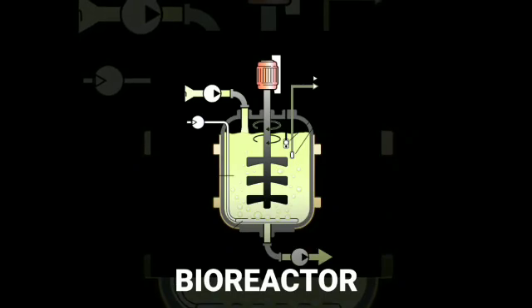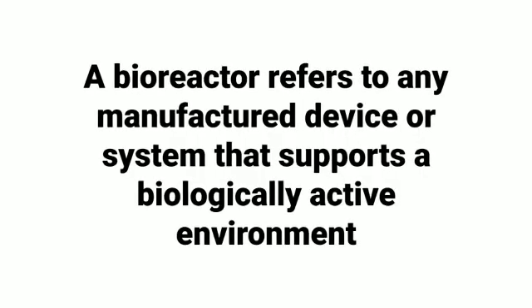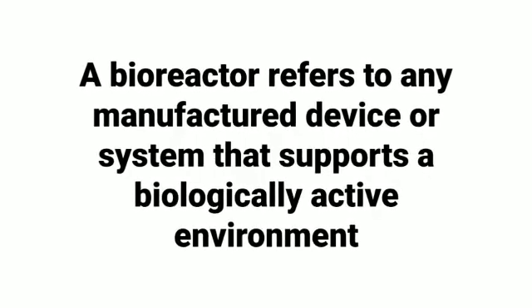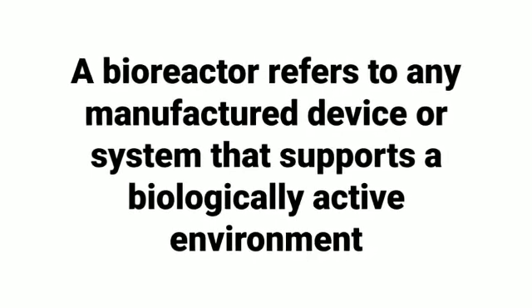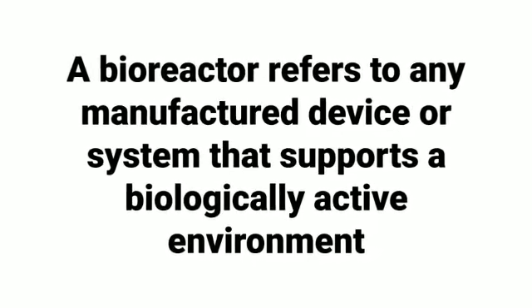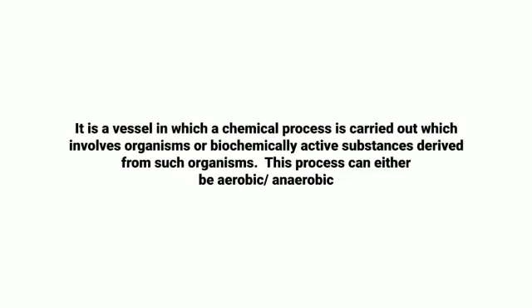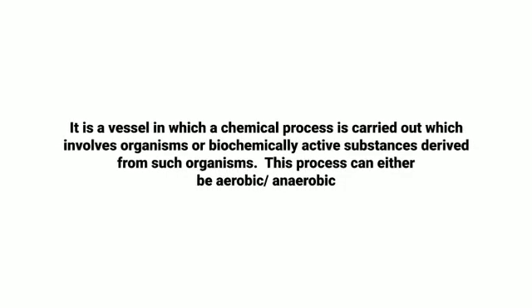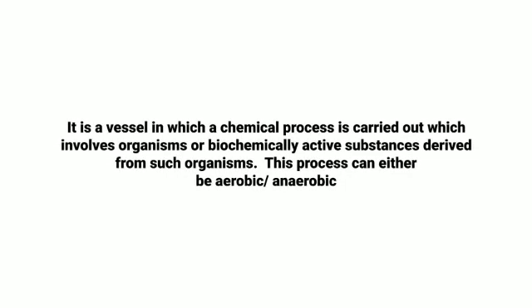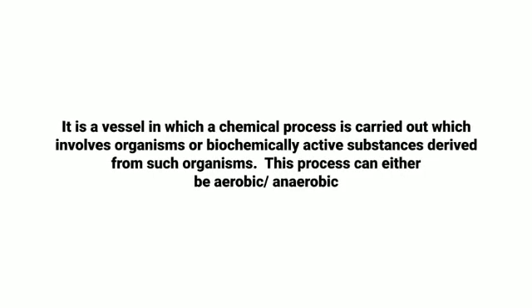Today's topic is bioreactor. A bioreactor refers to any manufactured device or a system that supports a biologically active environment. It is a vessel in which a chemical process is carried out, which involves organisms or biochemically active substances derived from such organisms. This process can either be aerobic or anaerobic.